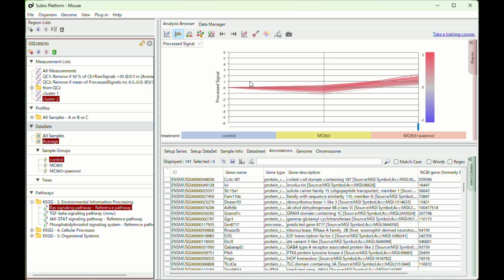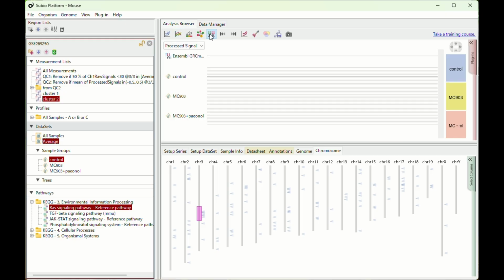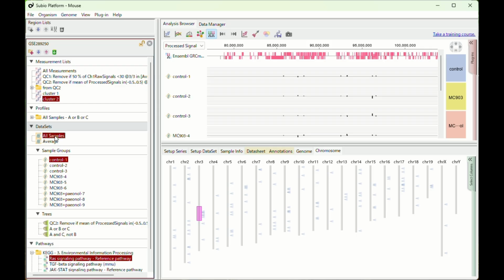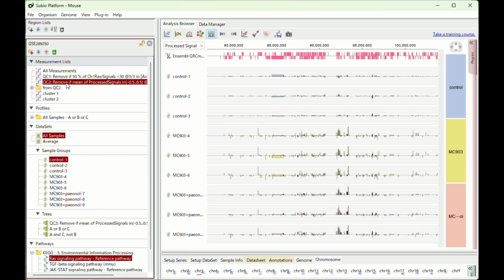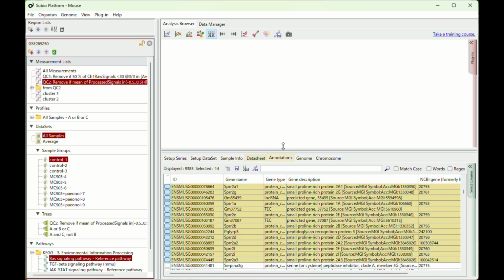Another exploration is to examine the chromosomal location bias of the selected pattern. You can drag a range along a virtual chromosome to view the expression pattern there. You can view not only genes of the selected expression patterns, but also other genes in the area. Now you find a cluster of genes that behave similarly. You can drag the area to see what they are.